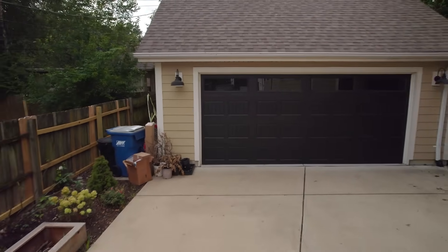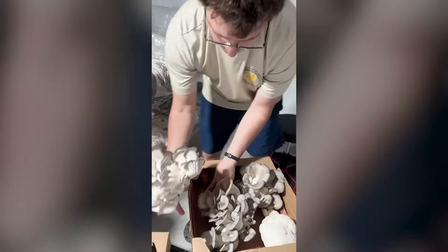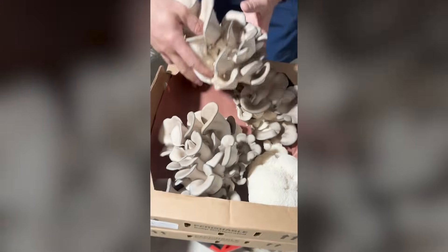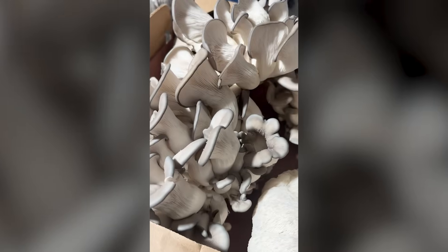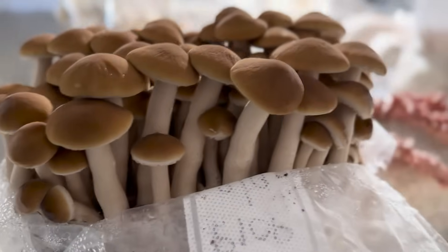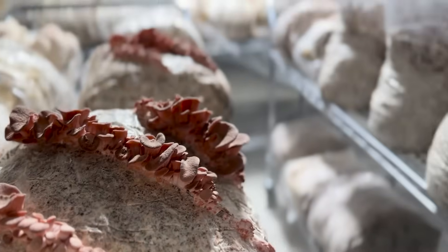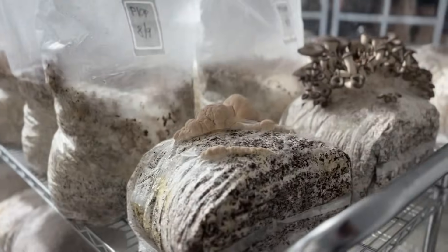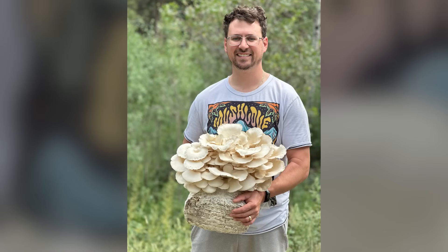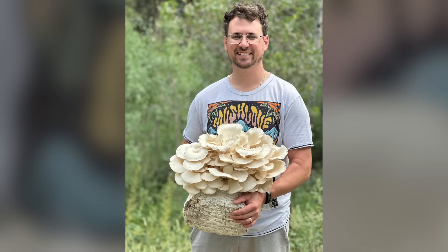What if your garage could produce a farm's worth of oyster mushrooms, custom bred for bigger yields and iron-clad contamination resistance? Today I'll pull back the curtain on the advanced breeding techniques used by large-scale farms and show you how to replicate them at home. By the end you'll know how to isolate, test, and scale your own high-performance oyster strains. No PhD required.